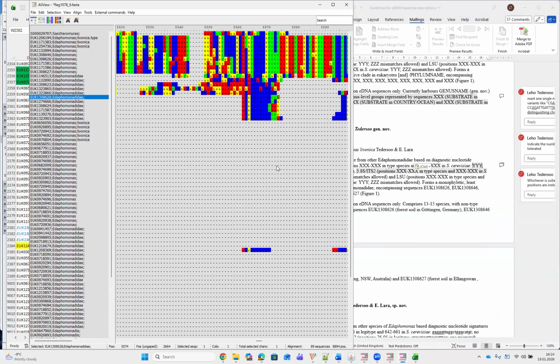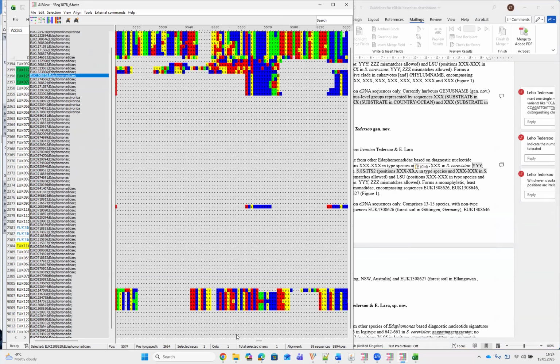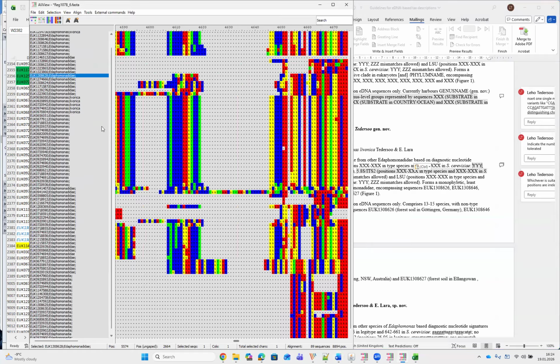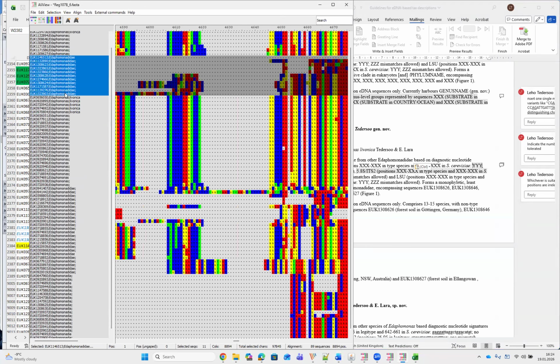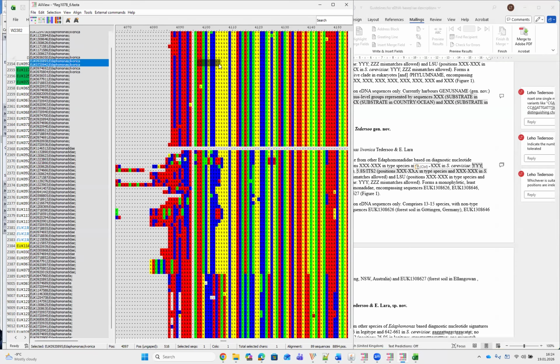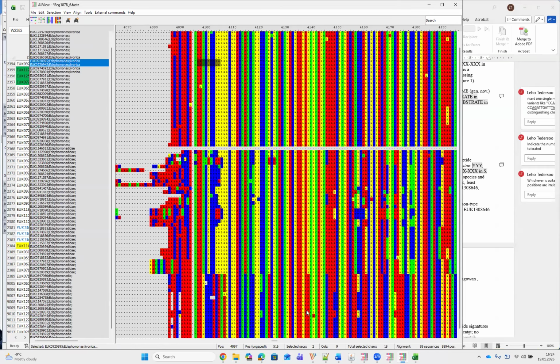So again, zoom out reasonably, and again start with the ITS2 and 5.8S. So I will take those family level sequences to the bottom so that it's easier to compare visually. So let's refine the ITS region. Okay, the 5.8S starts from here.